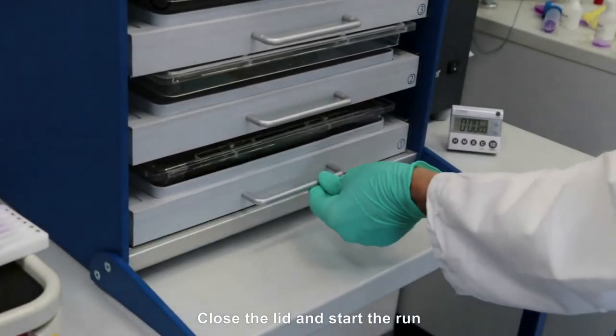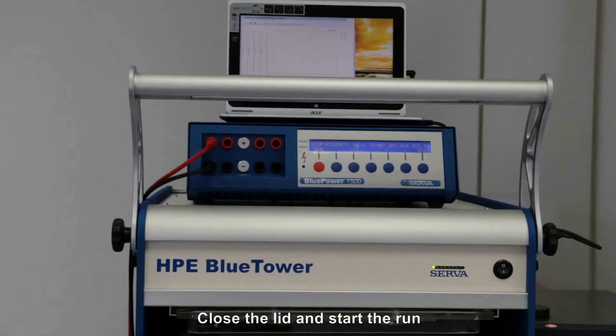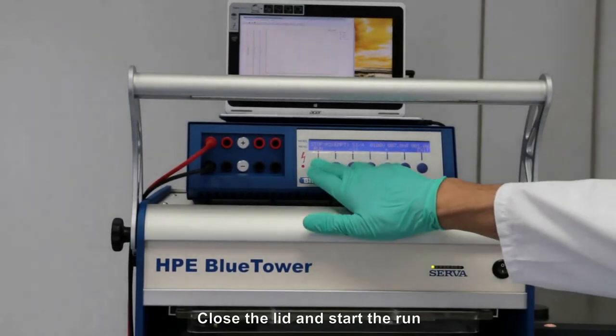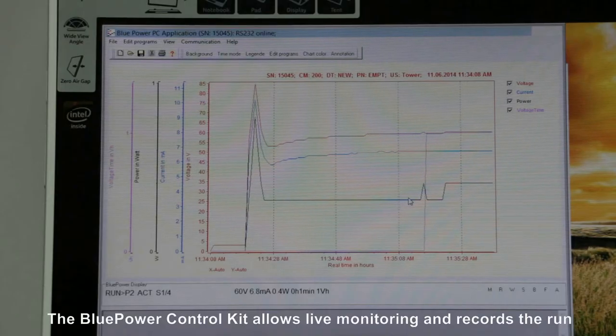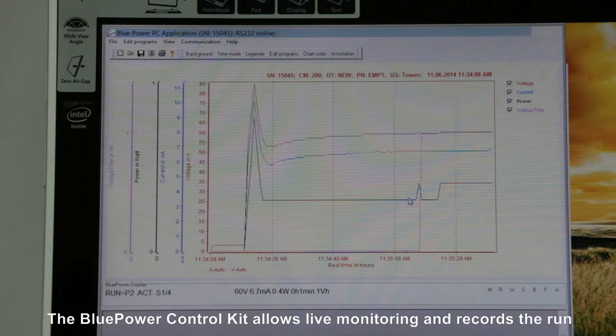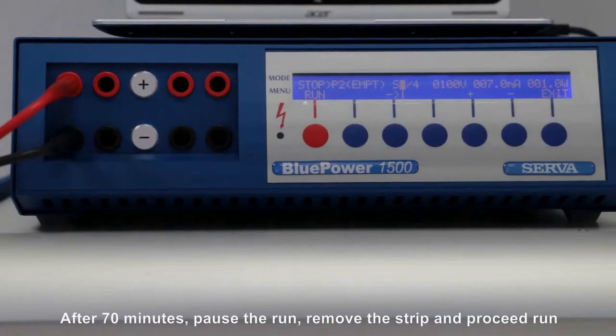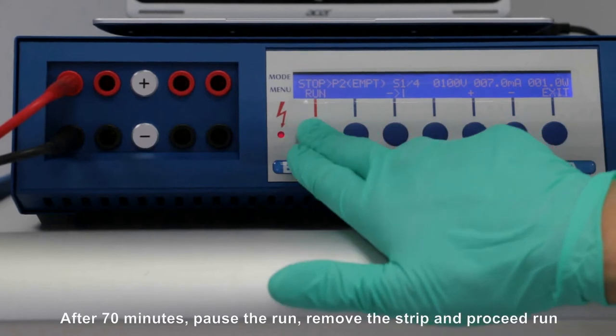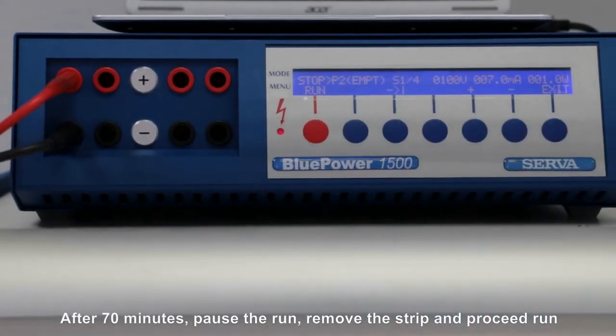Close the lid and start the run. The BluePower control kit allows live monitoring and records the run. After 70 minutes pause the run.